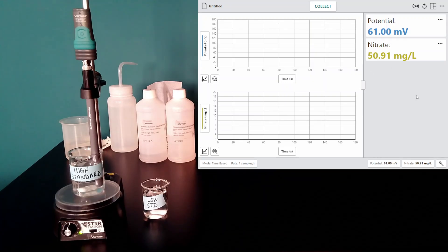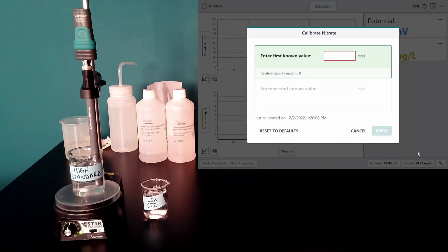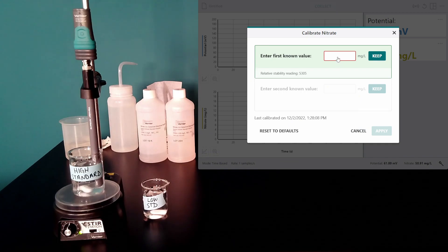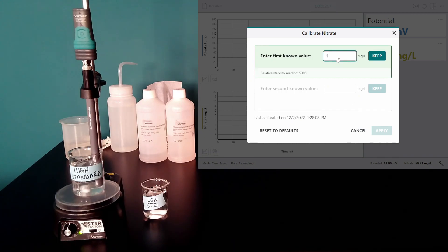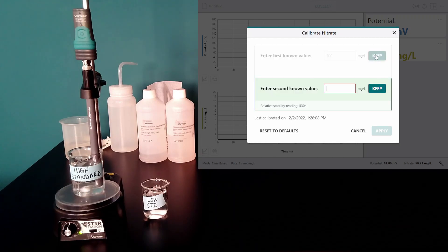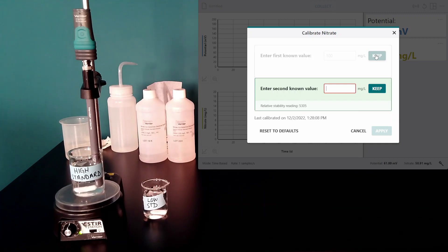To do that, I select nitrate, calibrate, and enter the first known value of my high standard, which is 100 milligrams per liter. I select keep, and now I need to transfer to my low standard.